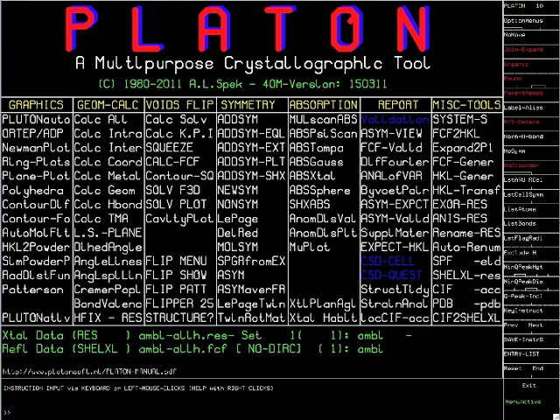We start by loading the structure from a cif or shellx res file into Platon. Structure factors must be available as well. They will be loaded by Platon automatically from an fcf file or shellx.hkl.